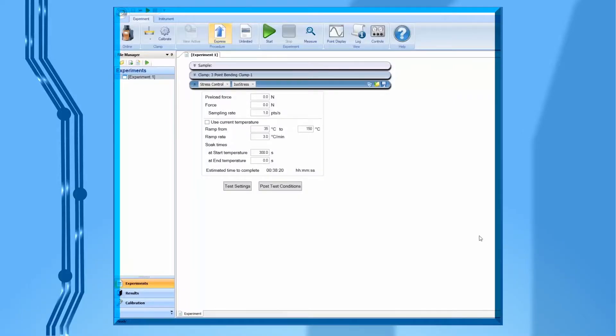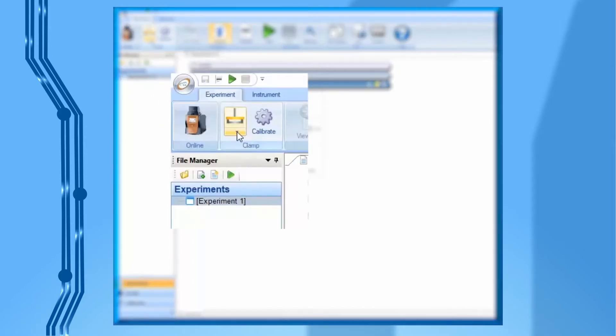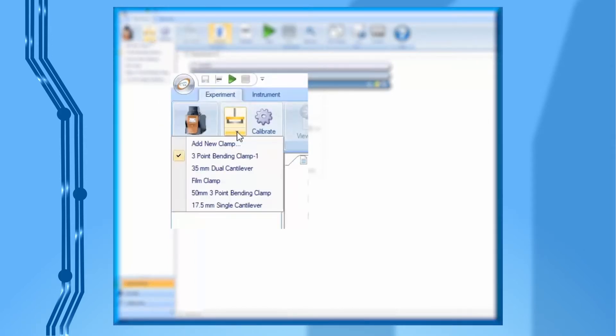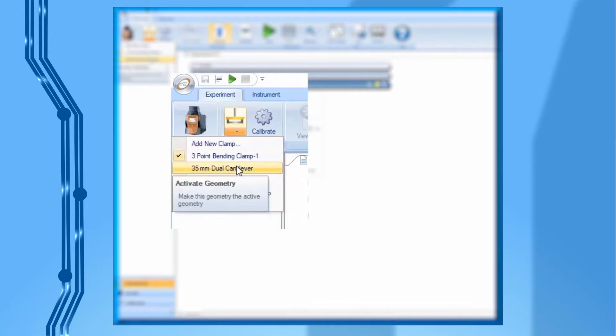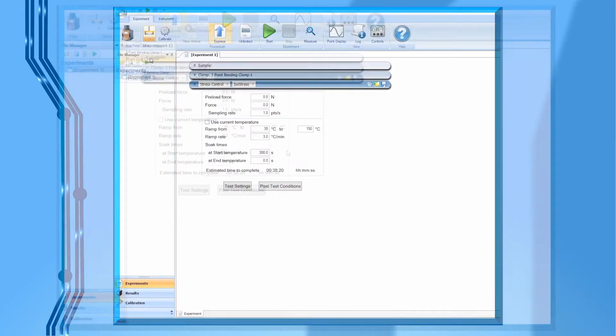Open TRIO software, click on the arrow on the clamp icon. From the drop-down list, select the name of the clamp you want to install and calibrate. For example, 35 mm dual cantilever.